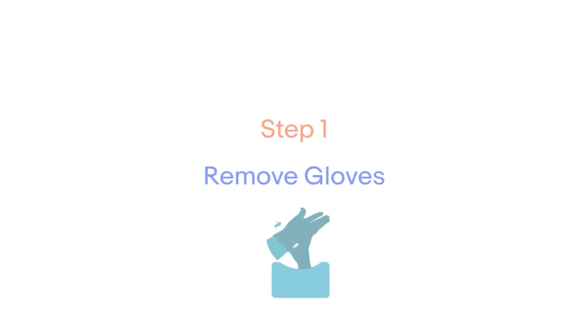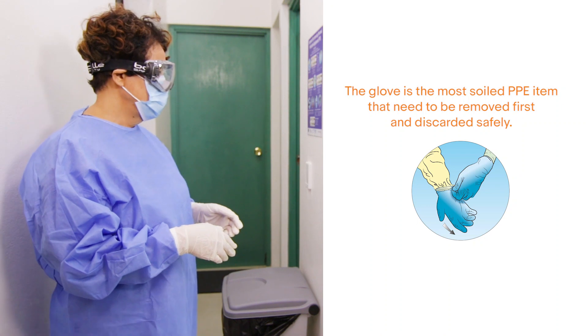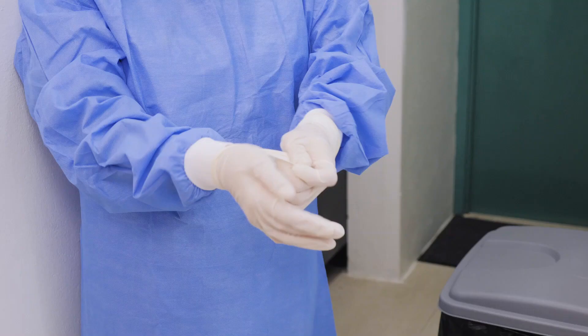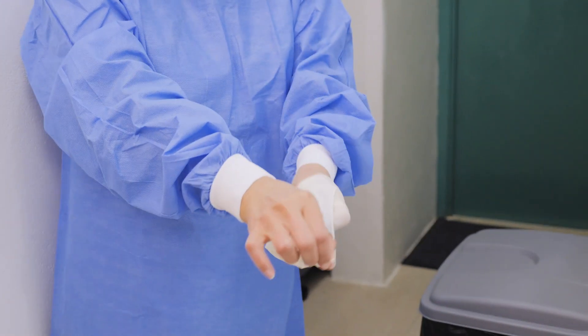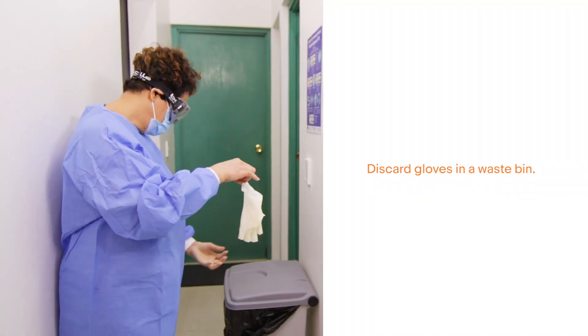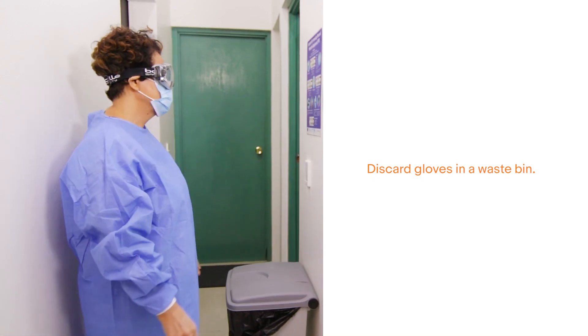The first step is to remove the gloves. Take care to never touch the skin with the outside of either glove. The glove is the most soiled PPE item and needs to be removed first and discarded safely. Grasp the outside of the first gloved hand with the opposite hand and peel off. Hold the removed glove, then with your ungloved hand slide your finger just under the wrist of the gloved hand and peel over the first glove. Discard gloves in a waste bin.